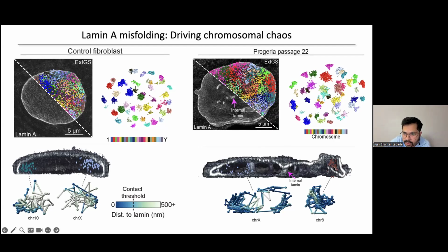In other cases, it can actually capture the entire chromosome in a small section, a small region. So it is causing a global disruption in how the chromosome is organized. So we can now detect these small scale changes, or these large scale changes. Not only detect, but we can sequence a specific chromosome associated with it.